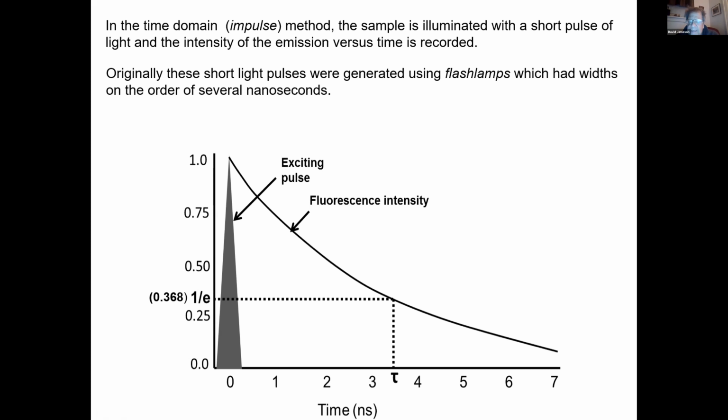So you can see it's like a statistical property of many molecules. Now, let me anticipate. Some of you may say, well, how do you ever do single molecule lifetime? Well, you do that by exciting it again and again and again. Because remember, lifetimes are so short, you can excite it thousands and thousands of times to accumulate the same sort of information.